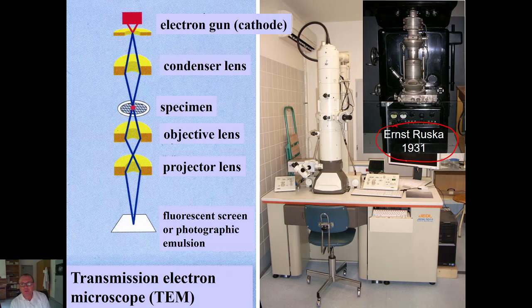Then the development was stopped during the war, so they were coming to the histological laboratories in the early 50s usually. So the method of electron microscopy is quite young, much younger than light microscopy. The first microscope was very primitive if you compare it with the current microscope, which is here in our department.